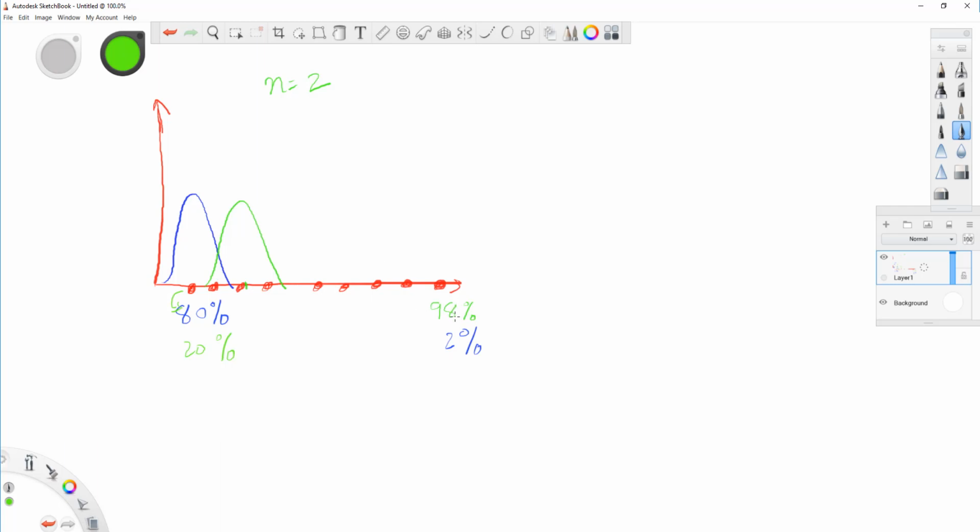I'm just saying, like 98%, it's the probability that this data point was generated by a Gaussian. And it does that for all of the Gaussians. If we have 5 different ones, then it does that for all of those 5. Again, this is not a hard assignment. In k-means, it's a hard assignment: either this belongs to green or it belongs to blue.